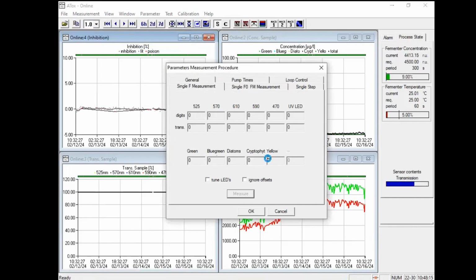Transmission, now it's calculating, and you see it's producing some values, and there's a small amount of green algae inside the water we pumped through the system, but it's a part of dirtiness that some of the algae which we use for the whole process are still somewhere in the tubes, but these green algae normally come from the culture here in a small amount.